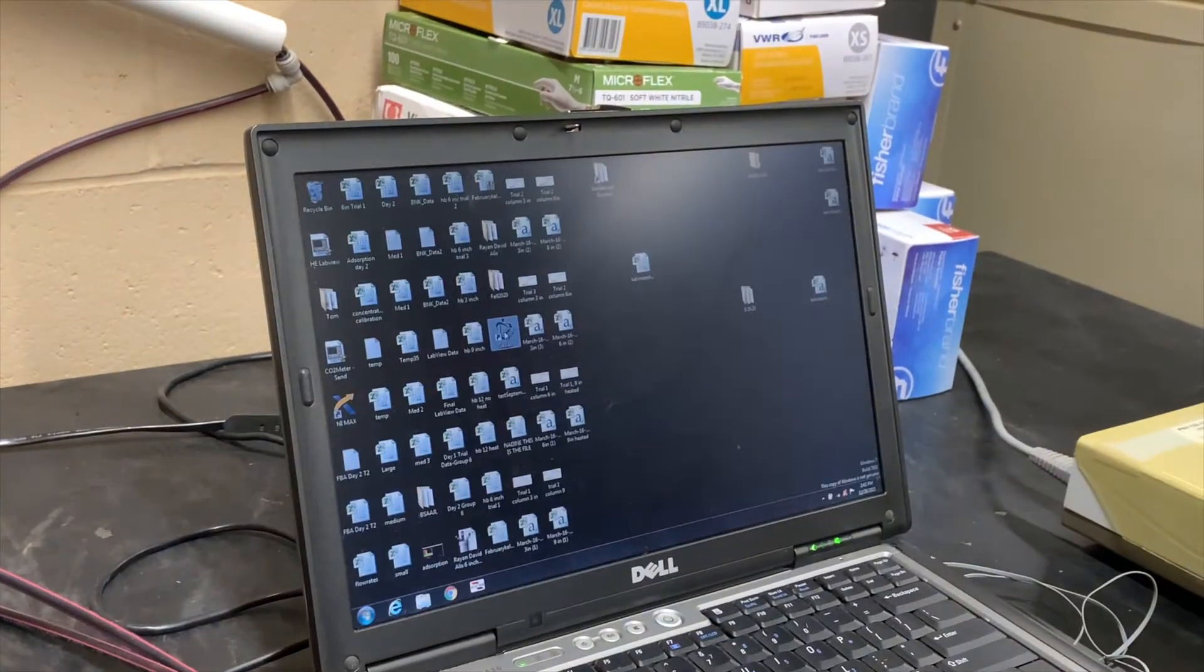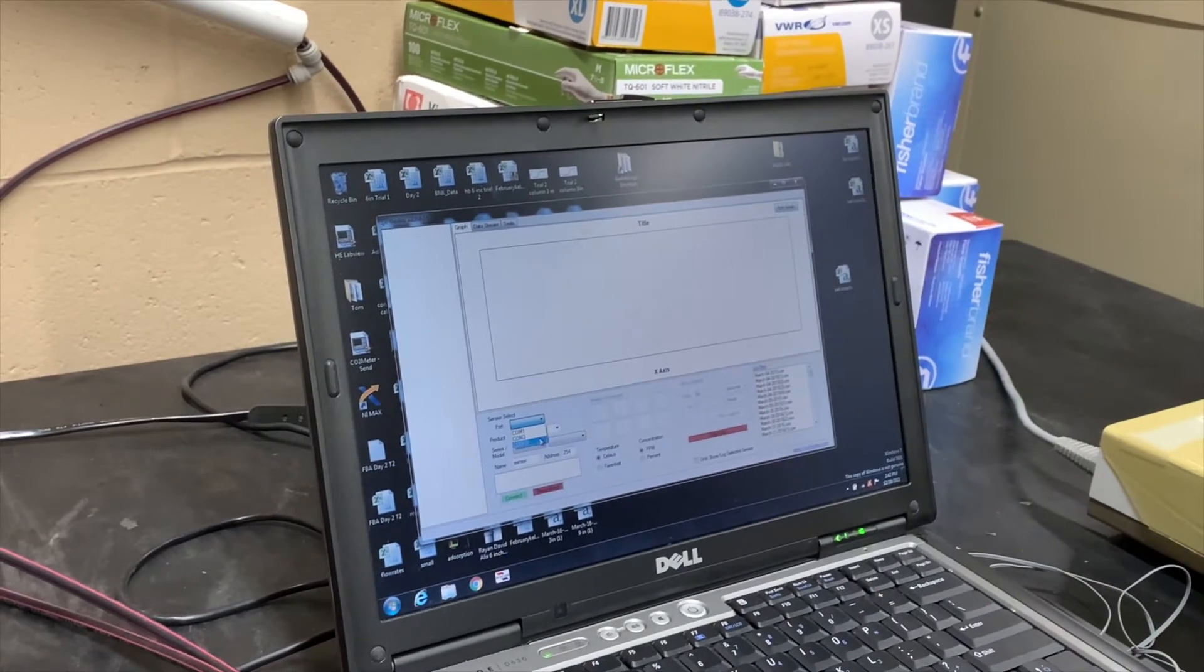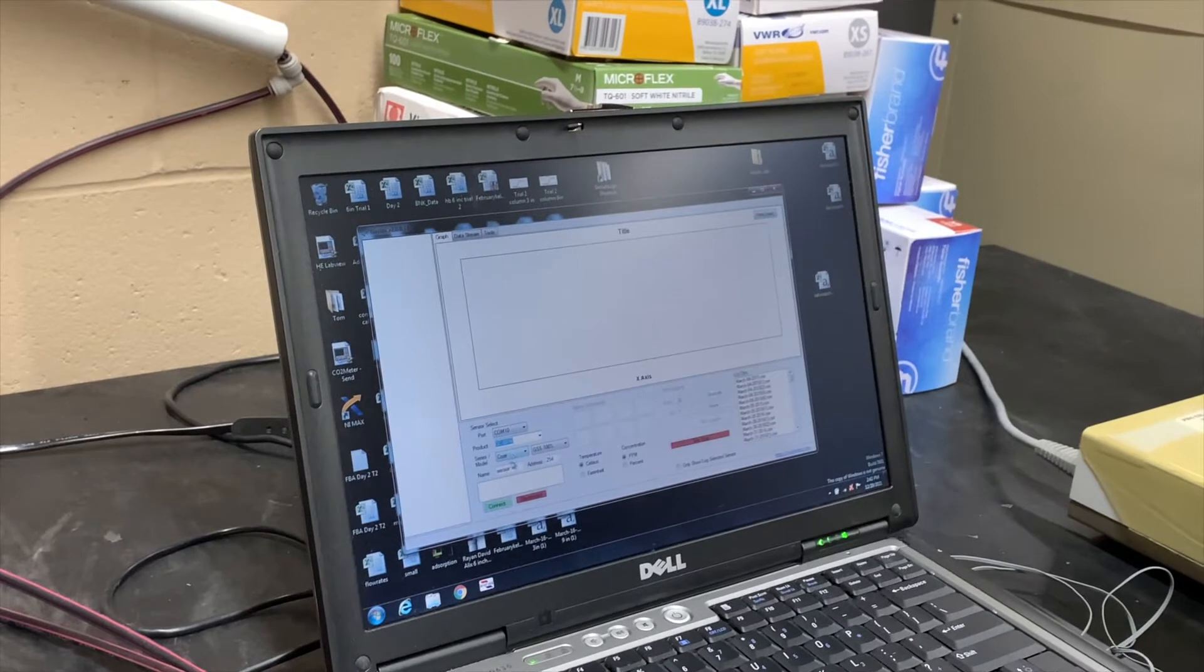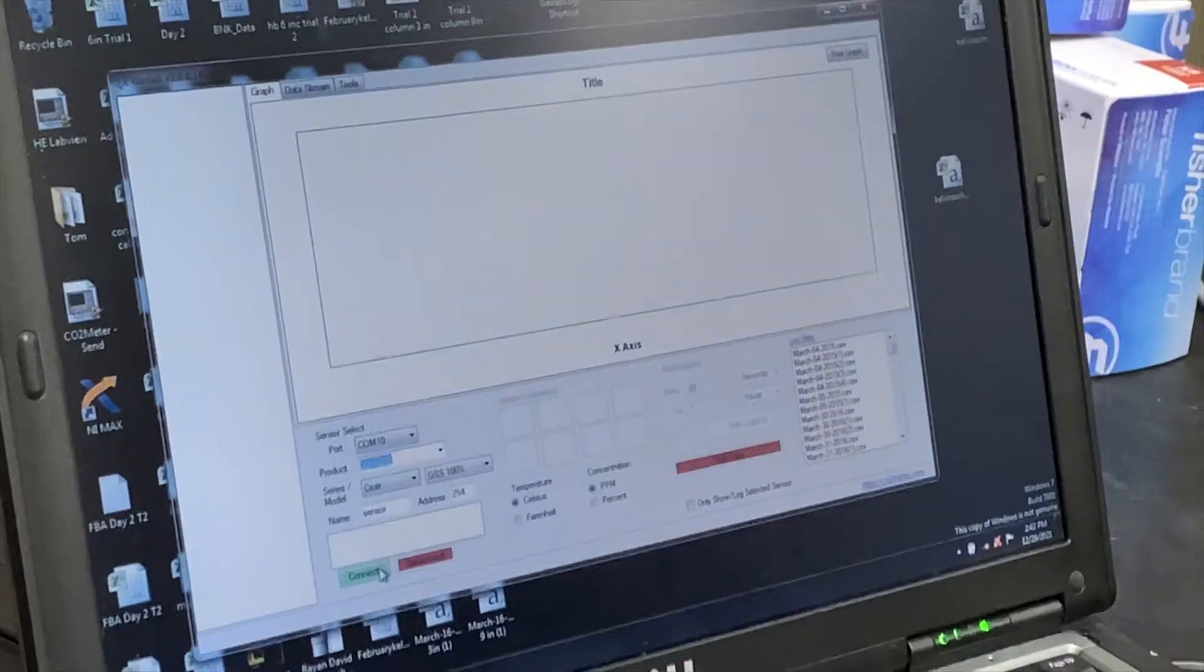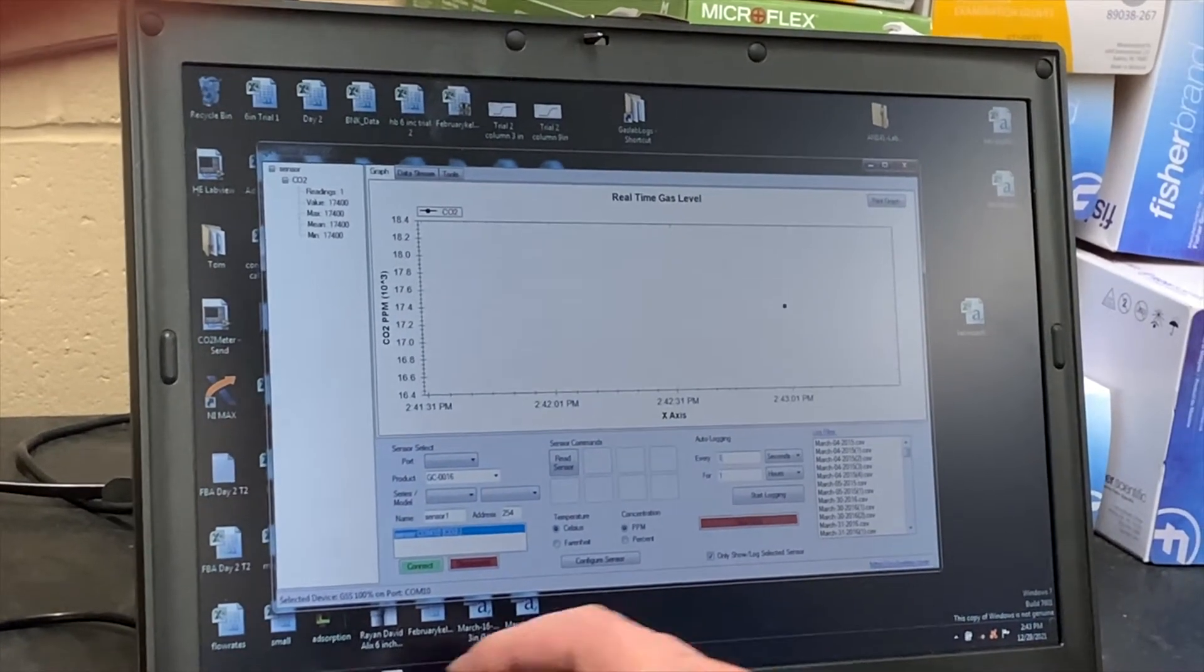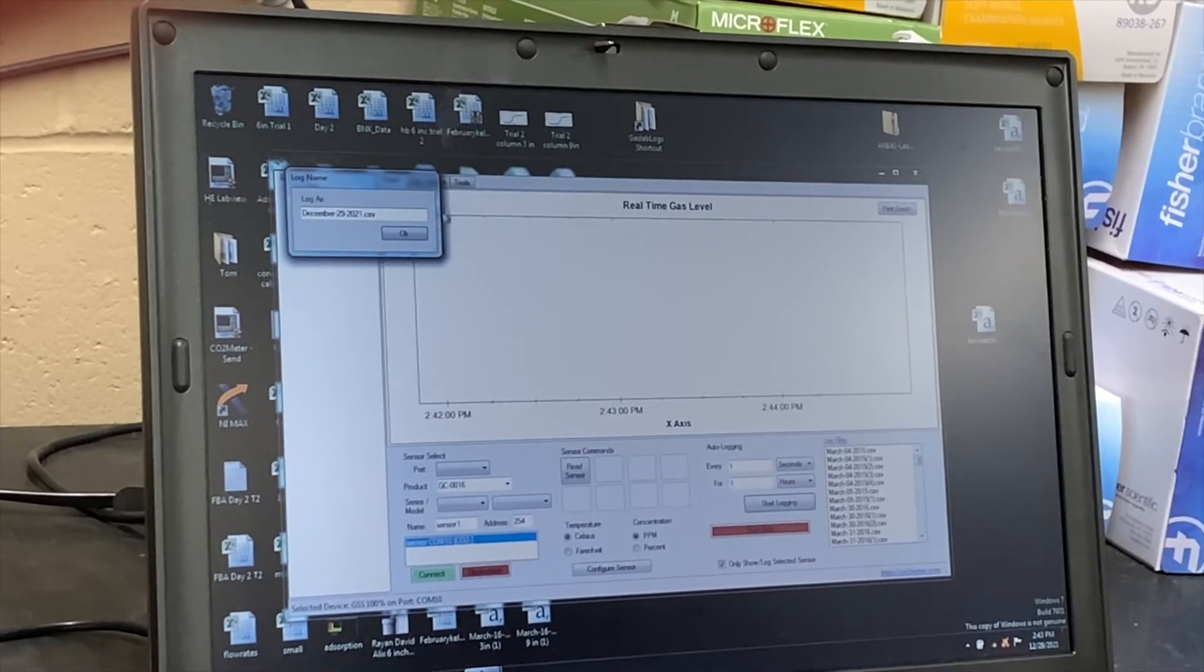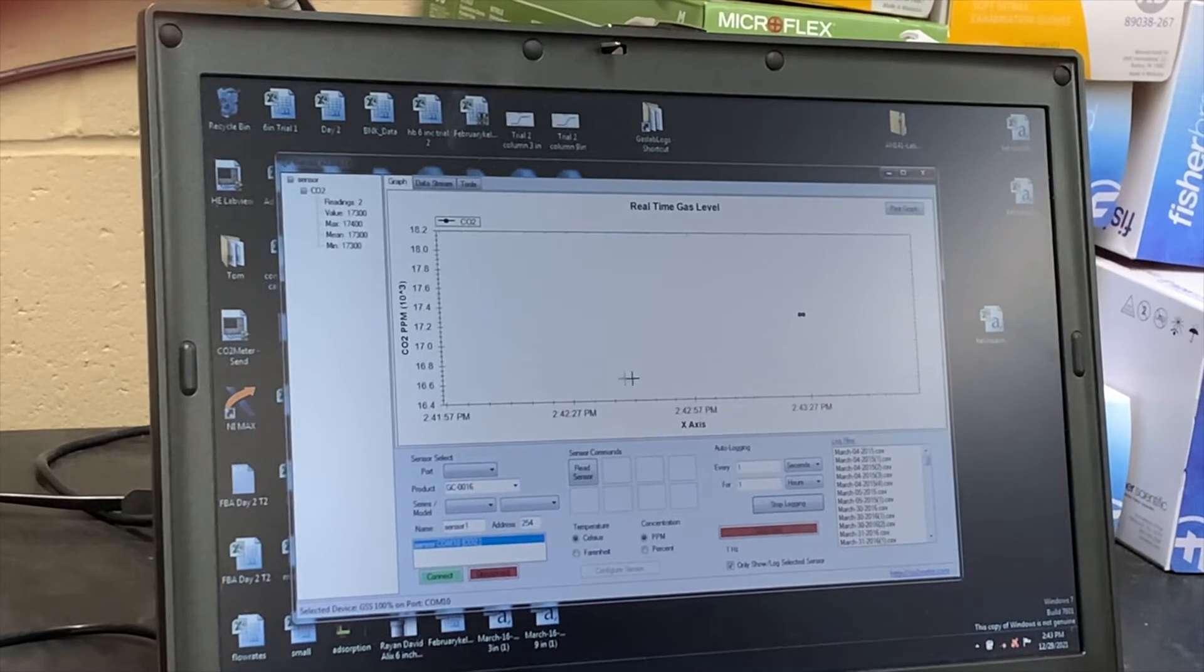For data acquisition, open the GasLab software. Set COM10 as the port, GC16 as the product, the series model to COSR, and GSS 100%. Click connect. Change the auto logging from every 30 seconds to every second. Click start logging and then OK so that the system may begin logging the CO2 readings every second.